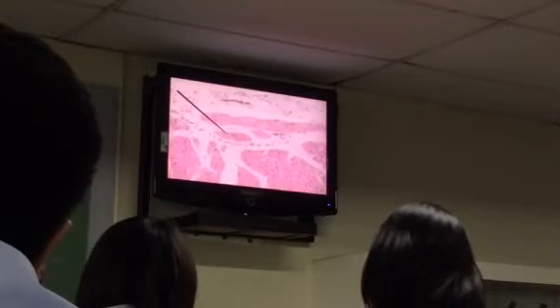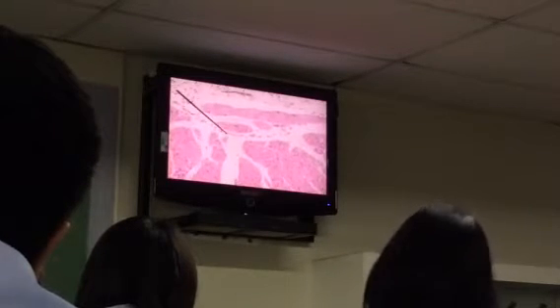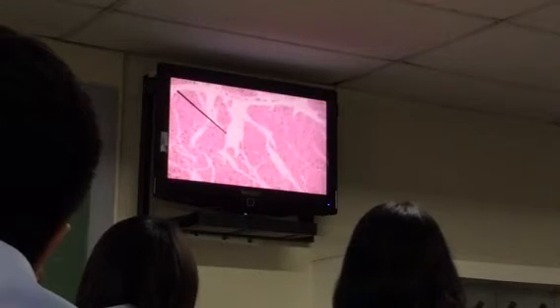Now, you have specific layers or sub-layers of your endocardium. So, ang endocardium ninyo ay magmula dyan sa portion na yan hanggang dito. Or pwede hanggang dyan. Kasi ito ay myocardium na because these are already cardiac muscles. So, from there up to here is your endocardium. It has 3 specific layers or sub-layers. This one is your endothelium.